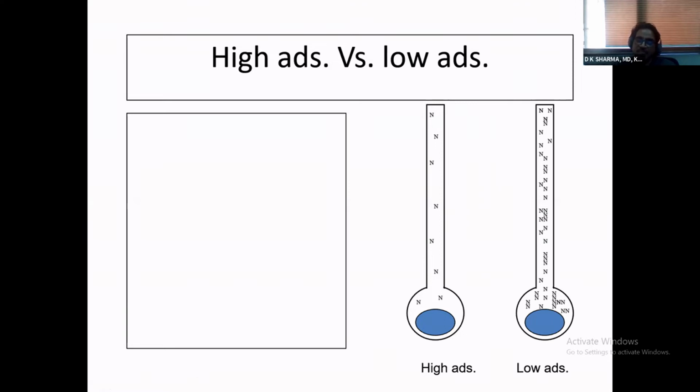It's quite common sense that getting precision in such a situation, where you have to deduct one quantity which is almost equal to the quantity you want to deduct it from, the precision of the calculations is likely to be not so good. So we have to create a situation where between the total amount of the gas and the amount remaining there is quite a nice gap, so that the calculations come out correct.